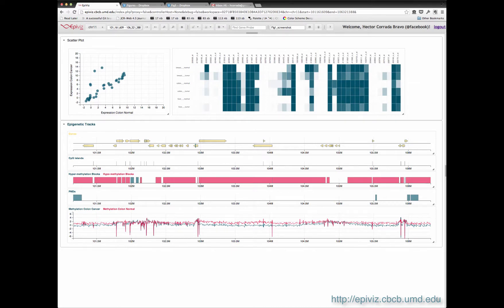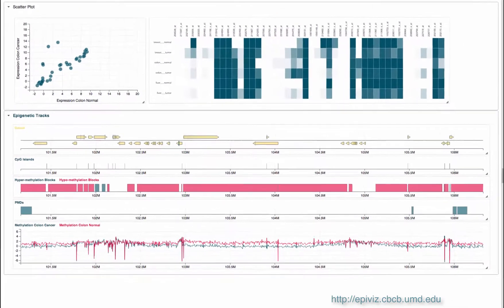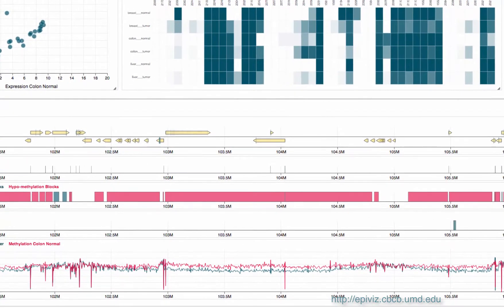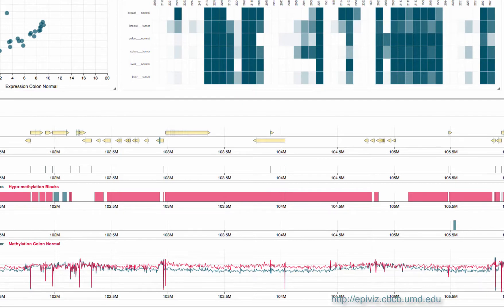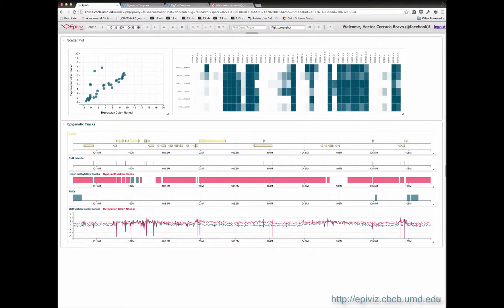Like other tools, EpiViz is organized into tracts that display data referenced by genomic location. This includes regions of interest or continuous measurements along the genome. Here we show regions of DNA methylation modifications in colon cancer.